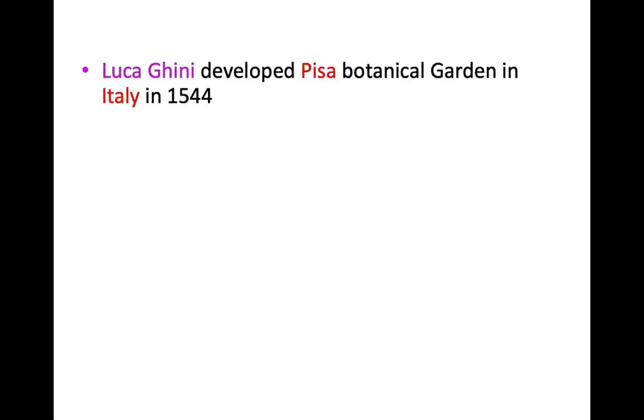The specimens may be whole plants or plant parts which are properly dried and pressed, taking care that they retain all essential parts necessary for identification.